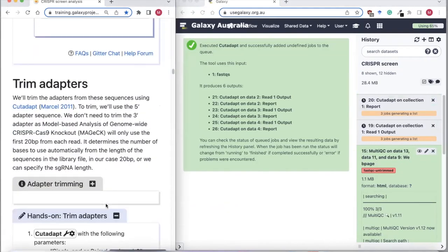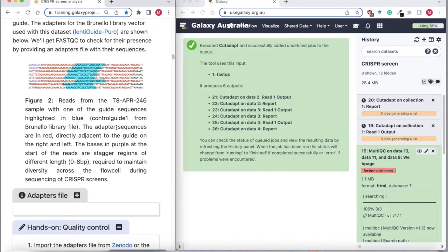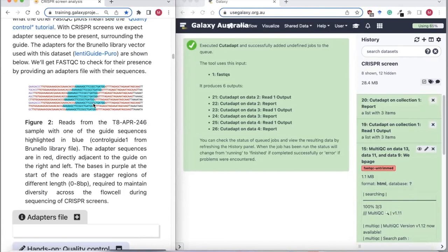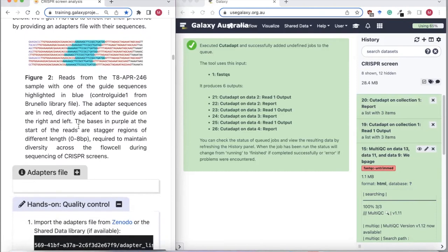Our guides are these regions in blue. We're telling CutAdapt to trim the front part — the bit in front of the blue — by putting in the 5' adapter sequence. We could also trim off the 3' adapters, but MAGeCK, the tool we're going to use for analysis, will take just the guide sequence from the front of the reads. So we really only need to trim these 5' adapters.